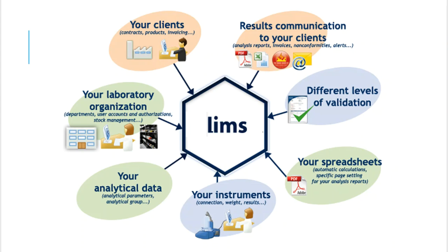And what you will find in the LIMS system is that everything is connected. So here, what we're talking about are instruments, right? Every single instrument that we use in a laboratory can be connected to the LIMS system, and it will constantly feed data into that software network database. Those instruments will include things like HPLCs and GCs, which you don't know what those are yet, but they also include something simple like an analytical balance. All right. Also, all the analytical data that gets generated from the equipment goes into the LIMS system as well, and that is an automatic process most of the time.